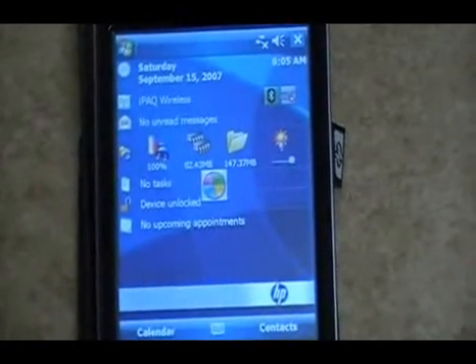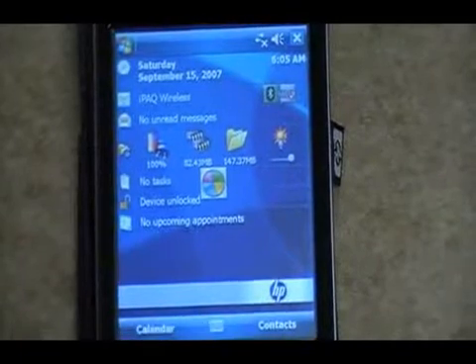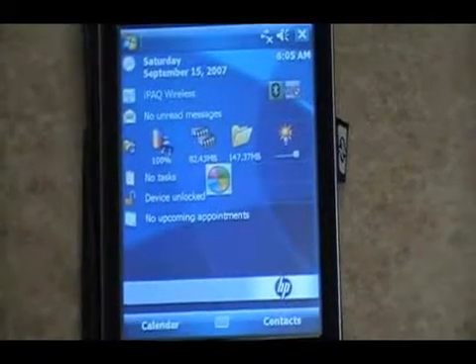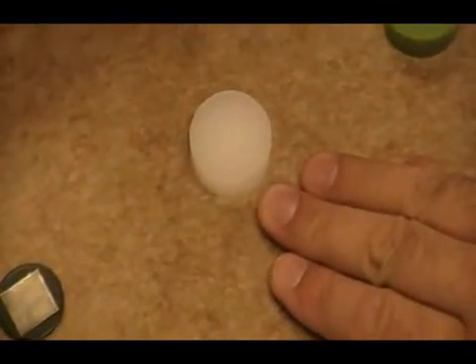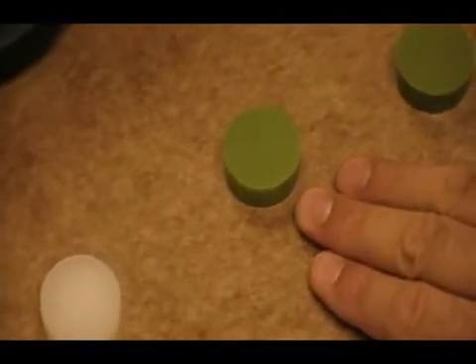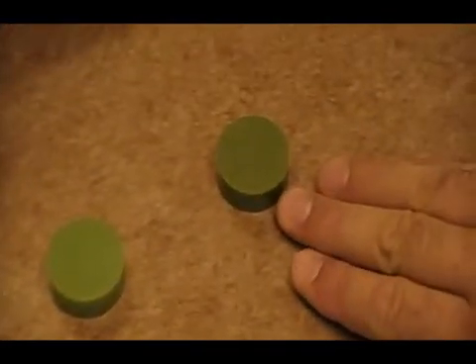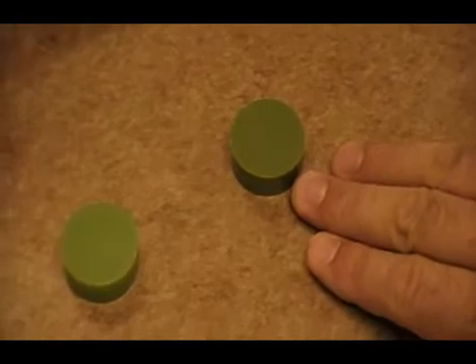At this point, I already have standards set out for us to run. So we will be running the silver initialization, polyethylene blank, polyethylene low, and polyethylene high.